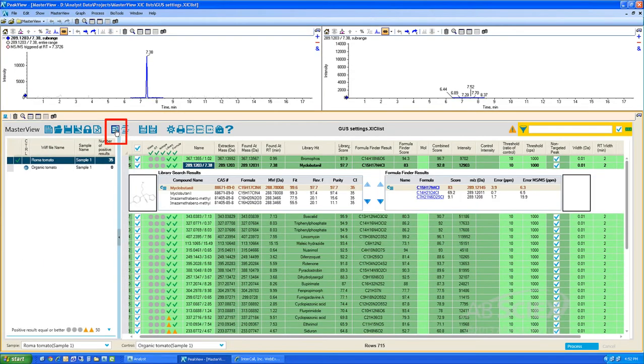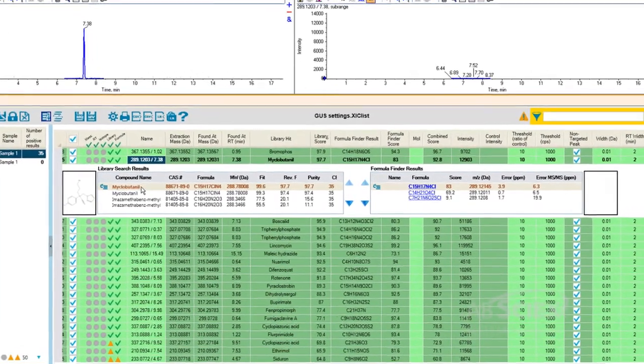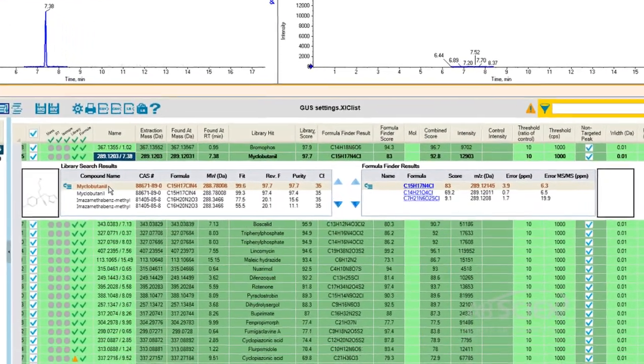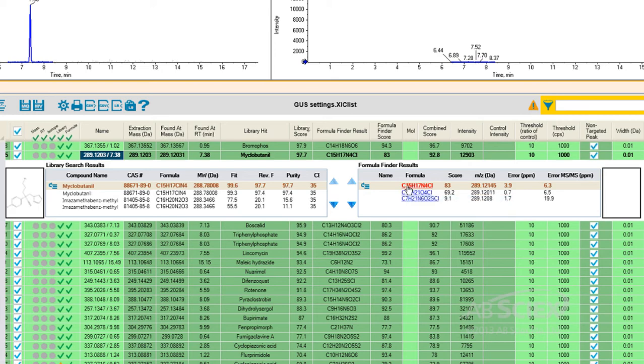To review the details of the automatic formula finder for the extracted peaks, we select the Show XIC Details button. The library search results for this peak display on the left-hand side, and the formula finder results for this peak display on the right-hand side. Here you can see that the library search results identified this peak as myclobutanil, and the formula finder results identified a few potential possible formulas, including C15 H17 N4 CL.